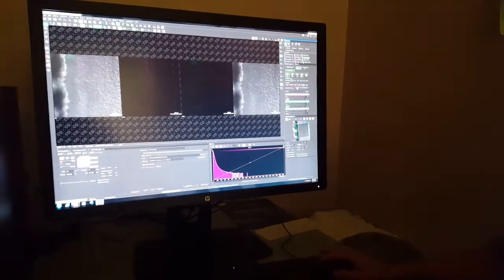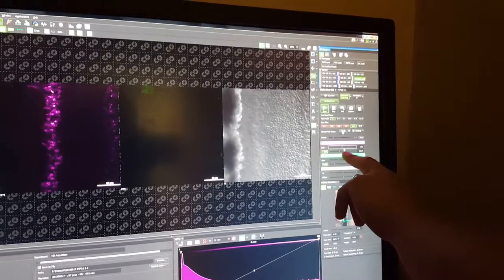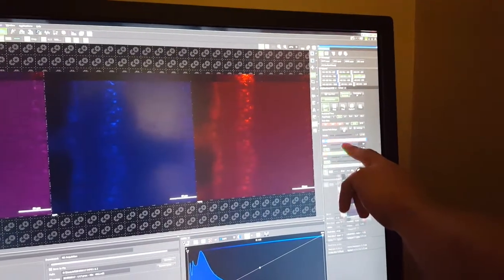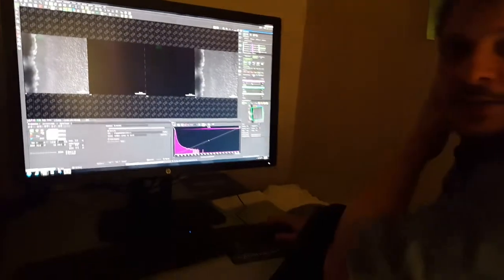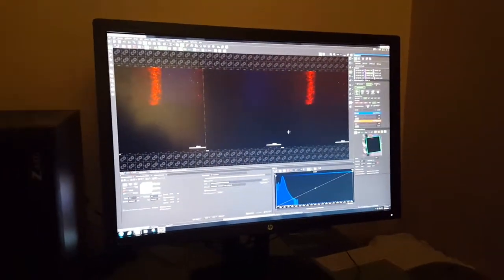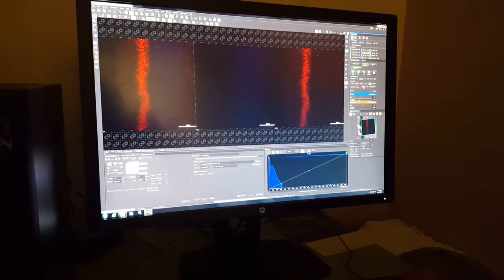So, for example, if I change it and I put 120 in this one, and I change to here and I come back, it's going to go back to the one that I saved. Okay? If you forgot to do this, you're going to lose it, you have to do it again. So, knowing that, we change to the blue and the red, and we have this image on the top. It's a good staining here. There is very little in the DAPI. Probably we have to increase it a little bit.